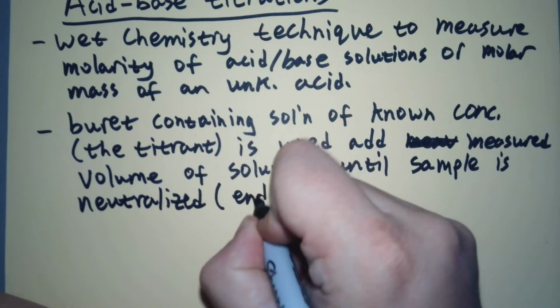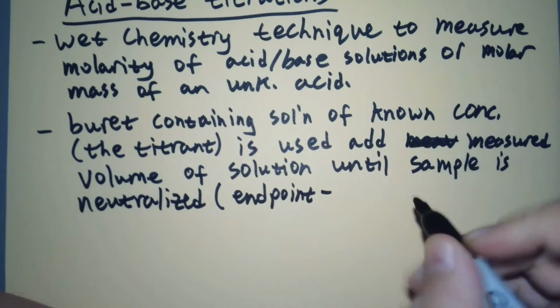And this is known as the end point, or the equivalence point.